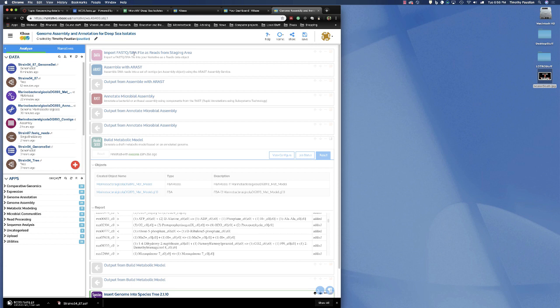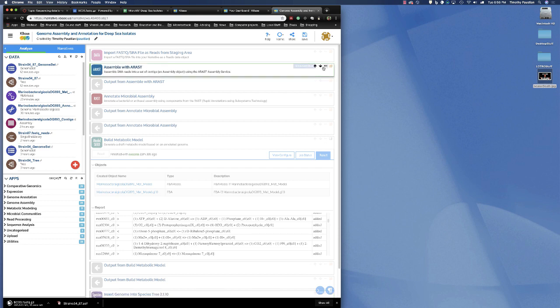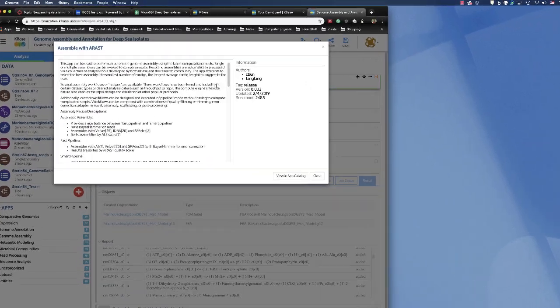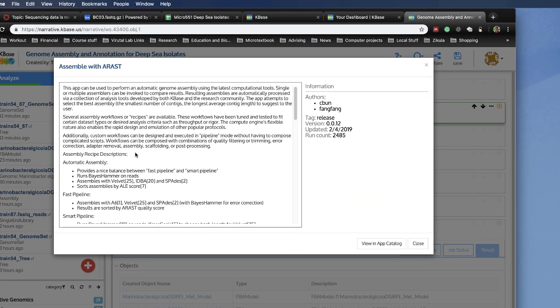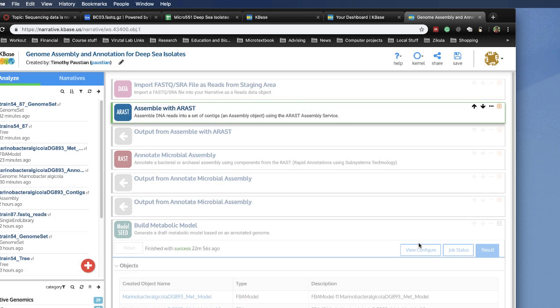We're going to bring up our fastq data. We're going to assemble it with ARAST. This is a series of different assemblies that it does. And it does it with, if you go and look at this, you can actually go to the info on this. And you'll see what it does is it does assemblies with A6, velvet, and spades. And that is three different assemblers. Then it compares those assemblies and gives you the best one to go forward with. So we're actually going to use that.